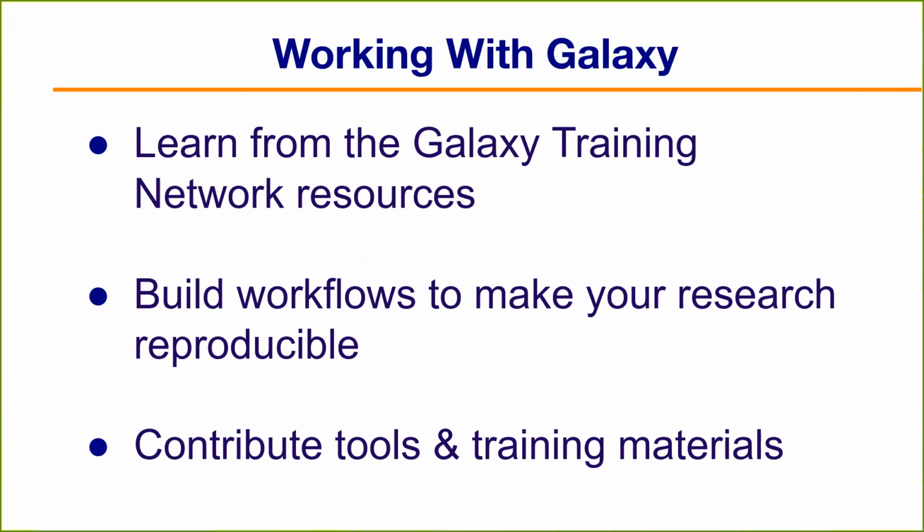So there's the Galaxy Training Network resources. In fact, I should have added a link here. I'll add this in a little bit: training.galaxyproject.org. That is the Galaxy Training Network resources. So there are tutorials on using Galaxy and on doing various analyses such as RNA-seq or assembly of samples or whatever various topics in Galaxy. As I said, it's a community-contributed resource, so it does keep growing. There are extensive tutorials now on doing your SARS-CoV-2 analysis in Galaxy if you're working on that pathogen.